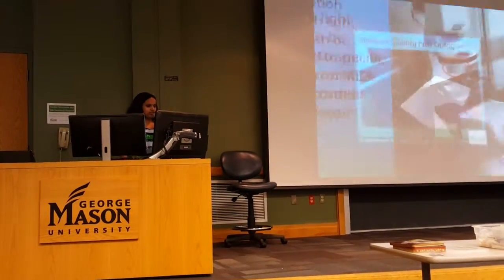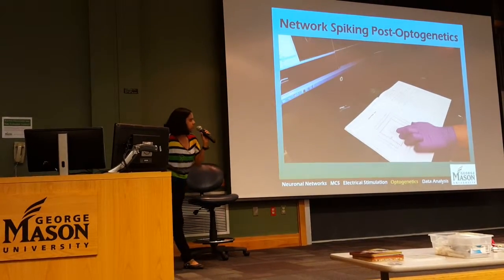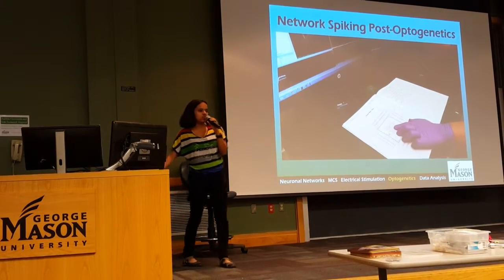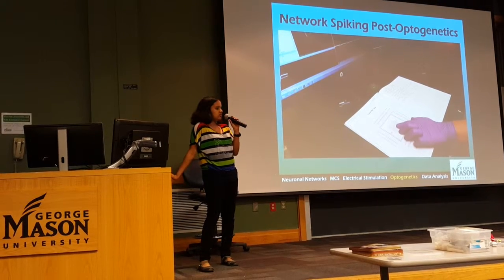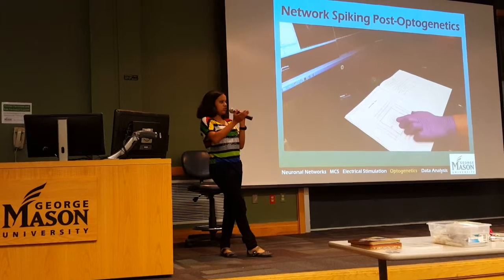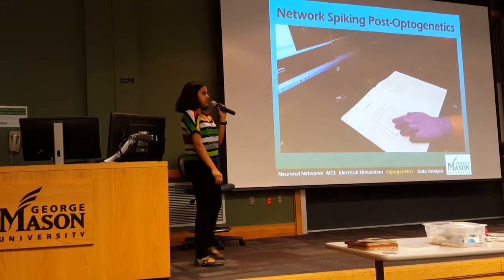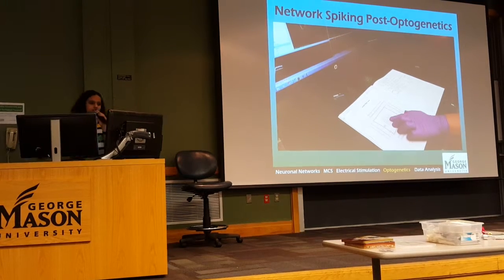I'm going to show you a video that was taken a few weeks ago. Alex is a grad student in our lab who's working on optogenetics. After he did an optical stimulation, he took a post-stim recording of some spontaneous activity, and we noticed something pretty interesting: one of the channels was showing a lot of activity.